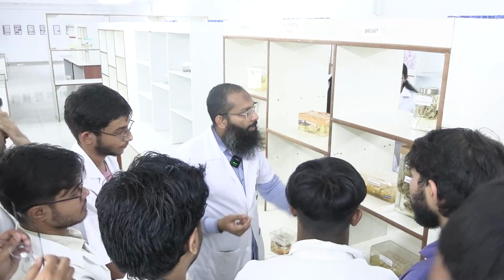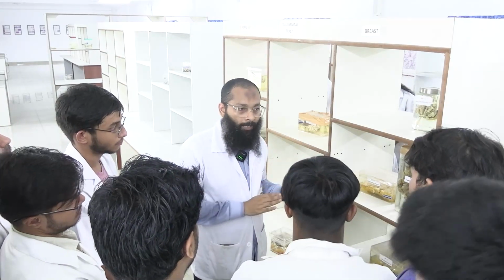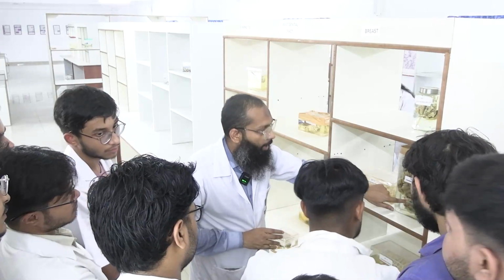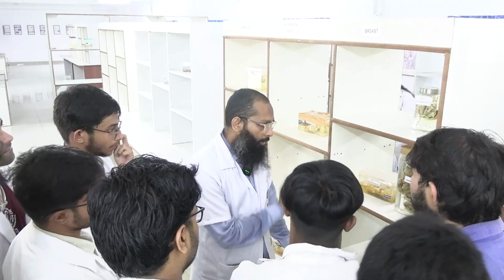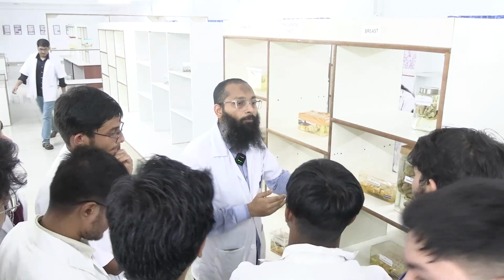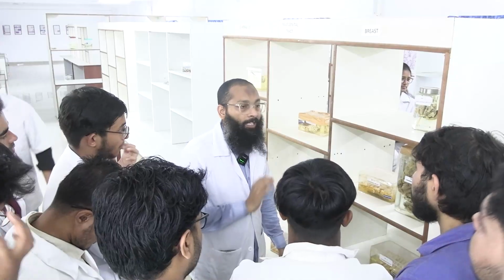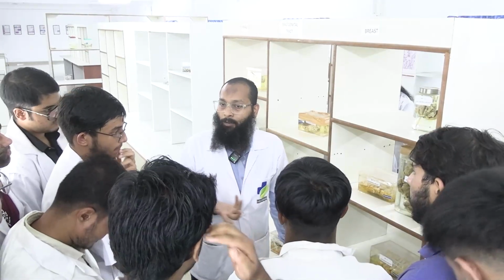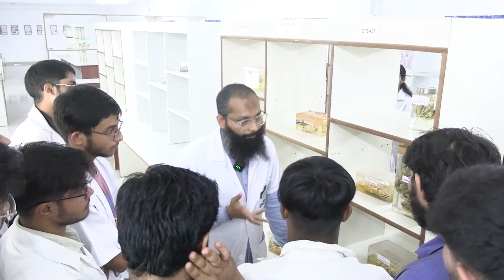Okay, will I cut randomly? I have to cut from representative areas. For example, sections have been cut from here, from the tumor proper. So I have to take a section or a tissue out from the specimen, and that too logically, not just randomly. That we call grossing. Did everyone understand?